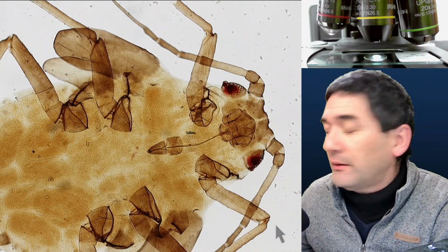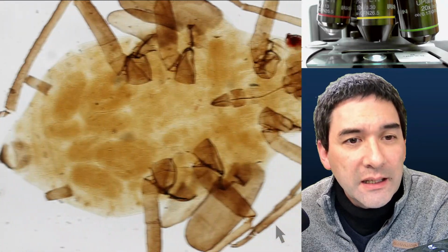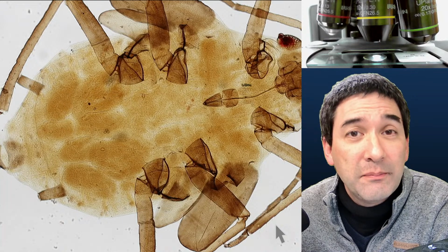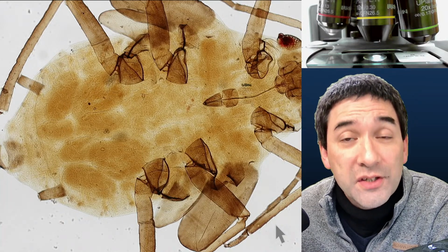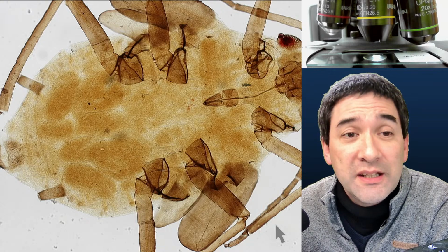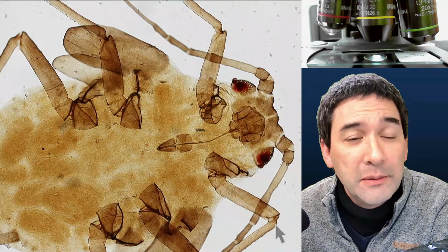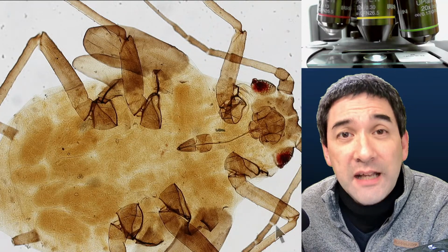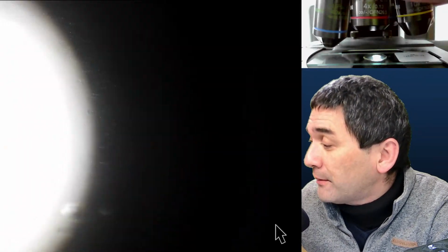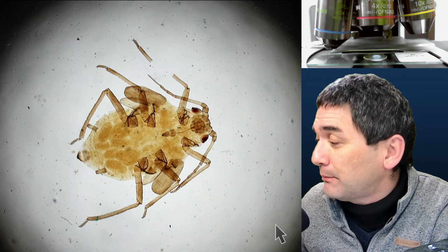One of the nice things about many of those specimens, and I also mentioned this already before, is that the insects were prepared in such a way that they became more transparent. So you see, it's not completely black what we're seeing here, but they're a little bit transparent. Now, in this aphid, I found something else that is kind of interesting, and I'm now going to go down with the magnification. I have to also go down here so that we see the whole insect better.